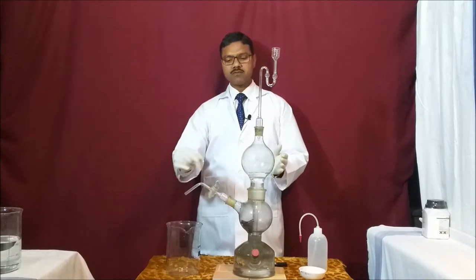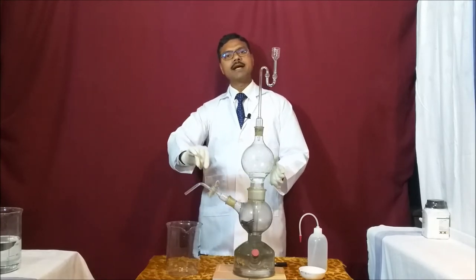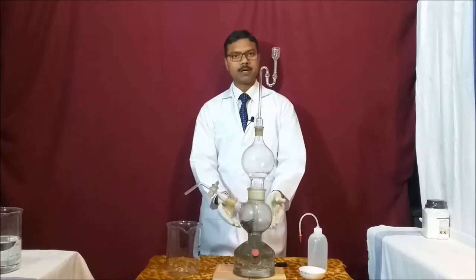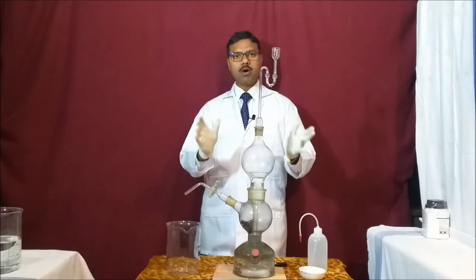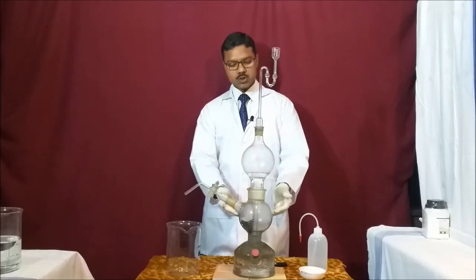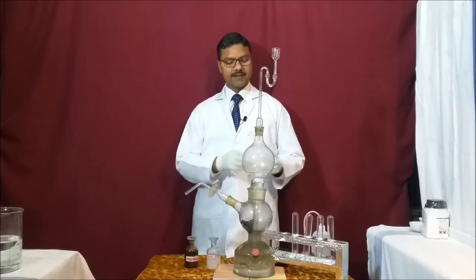This apparatus is especially useful to save the amount of acid. Because of the pressure of the gas, excess acid automatically comes into chamber A. When we release the gas through the knob, whatever amount of gas goes out, the same amount of acid comes down to the chamber automatically — this is how the acid is saved. Let me now show you the test to confirm whether H₂S gas is prepared or not.